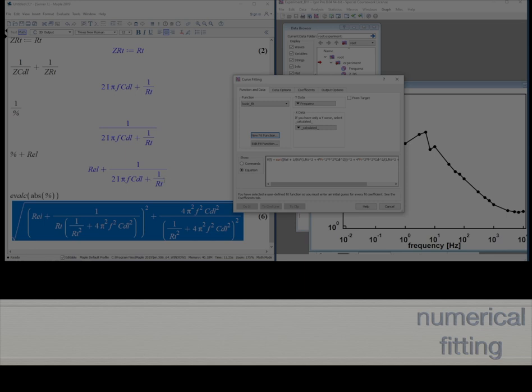What is the independent variable? It's the frequency f. Our coefficients are the electrolyte resistivity REL, the transfer resistivity RT, and of course the capacitance of the double layer CDL. At first, we test compile our new fit function. It was compiled successfully. Now we can save our fit function, and now it appears in the dialog as bode fit.